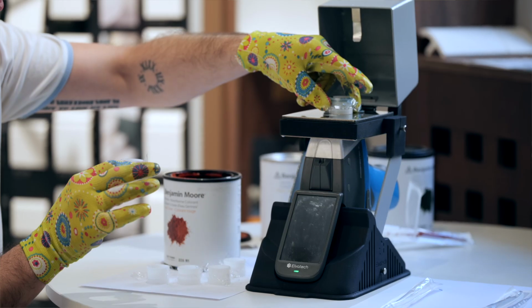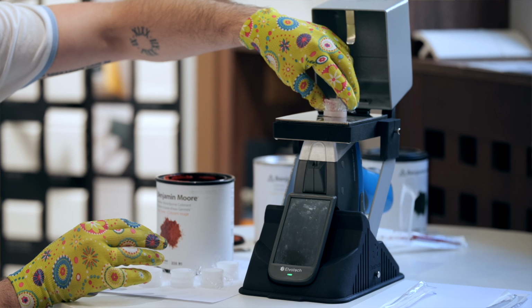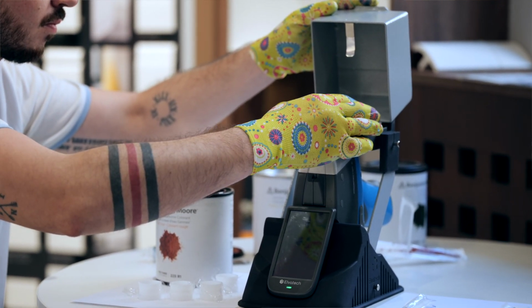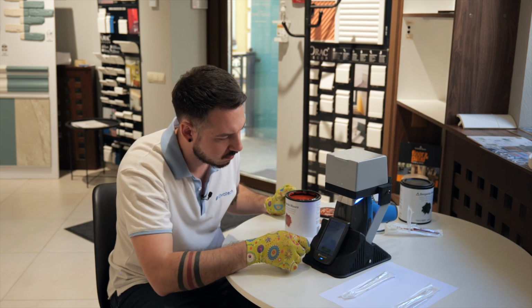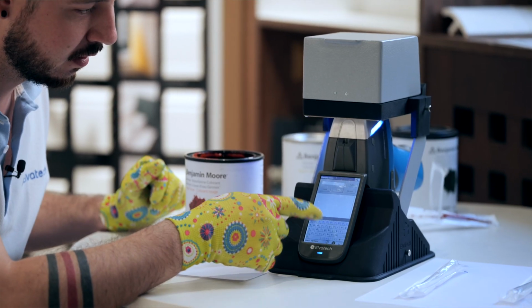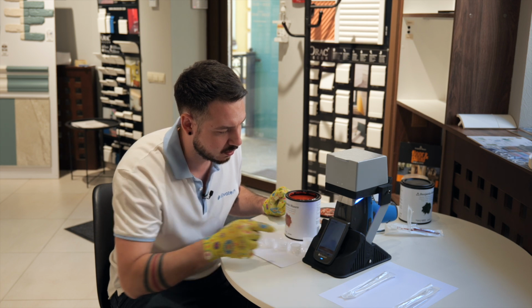And just need to switch both samples. And let's start with the second one. We'll name it 2 and let's go.